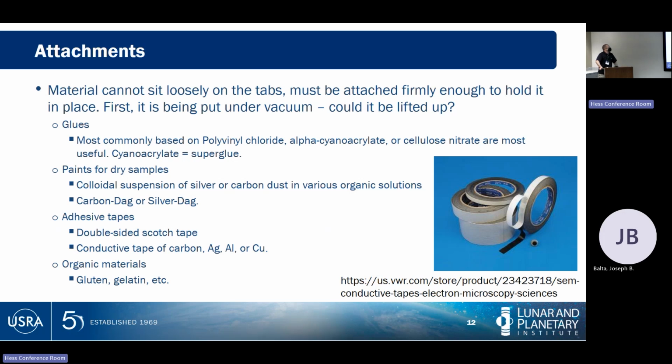There are different ways to connect things to these tabs. There are some versions of organic solvents that are sticky. There's a list right there, okay? This one is literally go to a hardware store and buy a tube of super glue. Sometimes a fix works out.